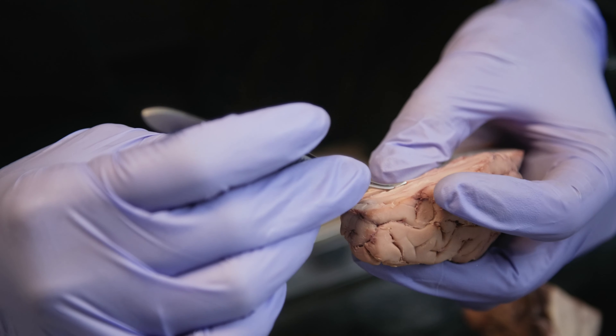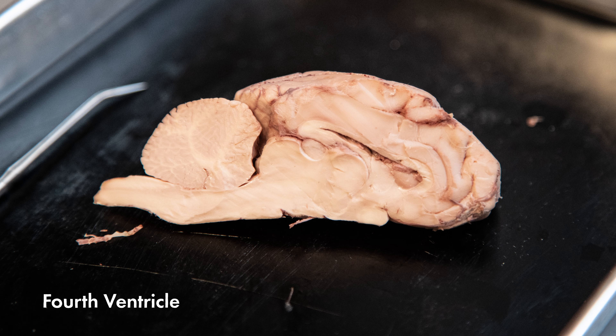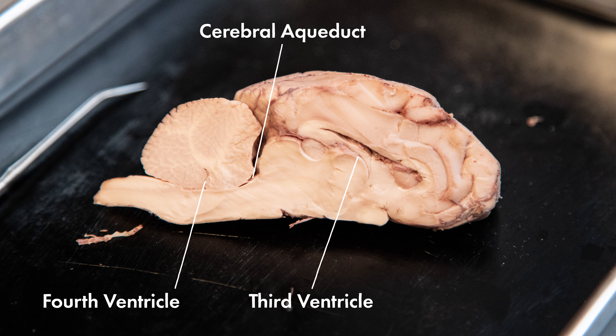The septum pellucidum is a thin transparent membrane located inferior to the corpus callosum on each hemisphere. Next, let's locate the third and fourth ventricles. The fourth ventricle connects to the central canal of the spinal cord, and is also connected to the third ventricle by a cerebral aqueduct.